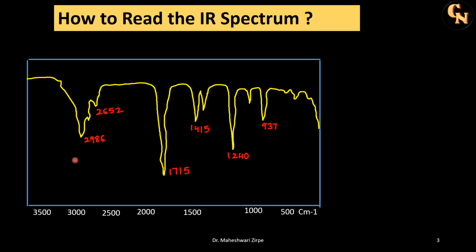Seeing the values, you have to detect which functional group each is representing. Either you have to learn those values or practice reading the IR spectra using the chart. Once you do this, some of the values will be memorized by heart, because many functional groups are repeated in organic molecules.